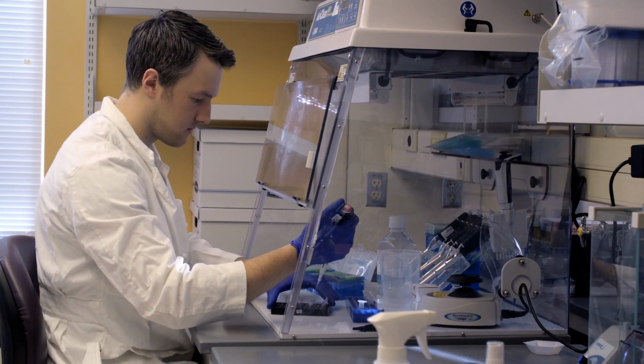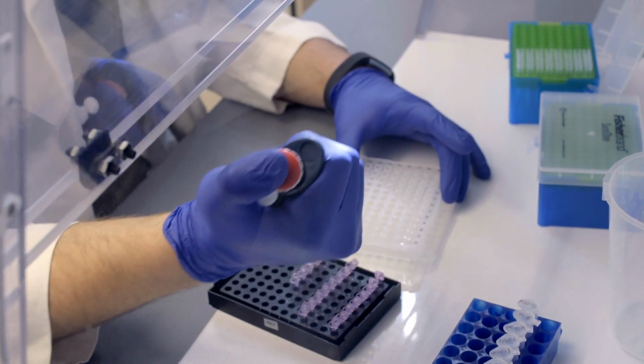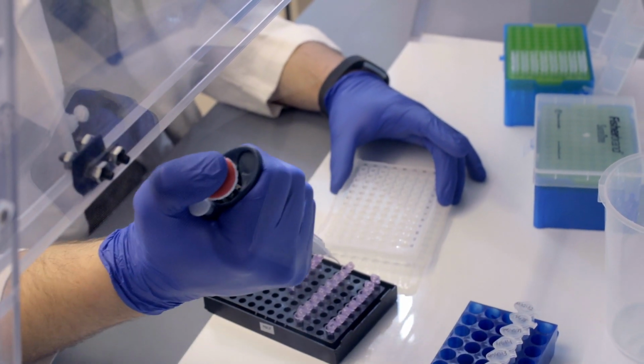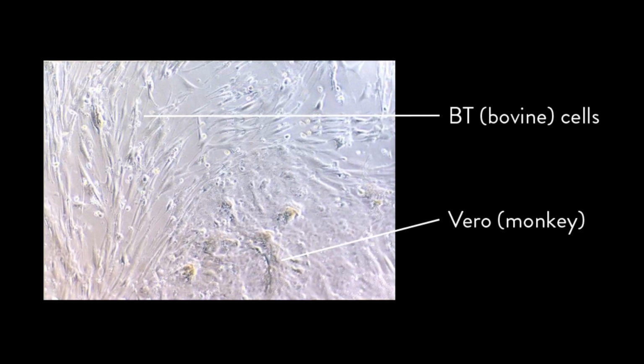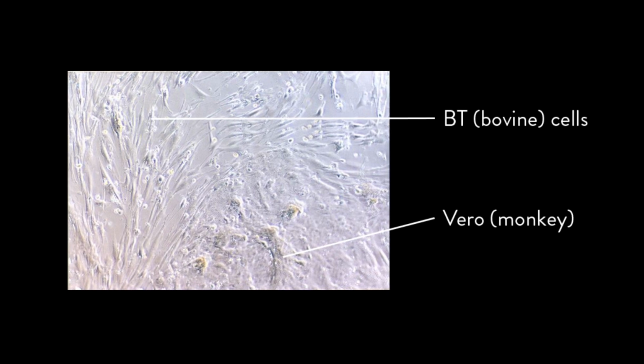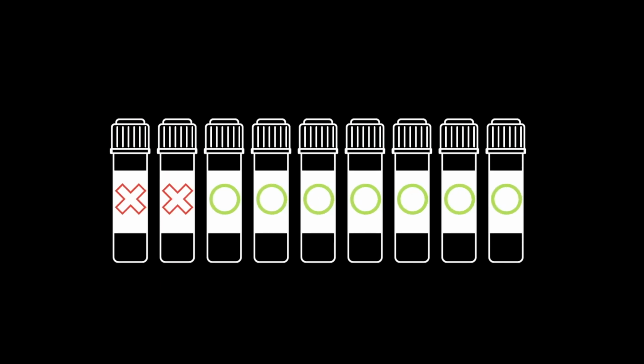More than 95% of the traditional, if not 99% of the traditional classical cell lines do not have an original sample to which to compare. A lot of labs are still ignorant of the degree of cross-contamination and mix-up of cell lines. They're ignorant how big of a problem it is. 2 out of 9 cell lines are misidentified. Can be due to mix-ups, can be due to mislabeling.